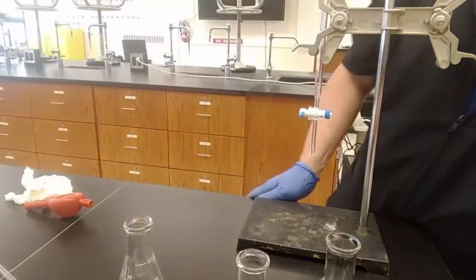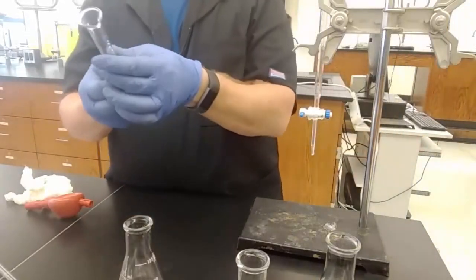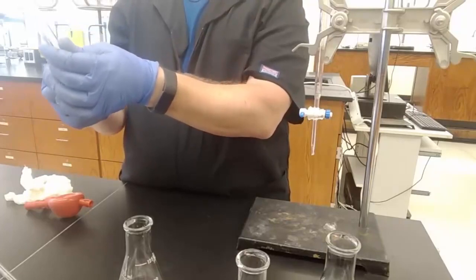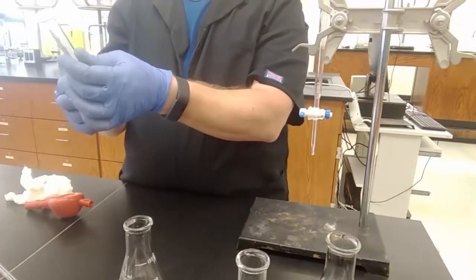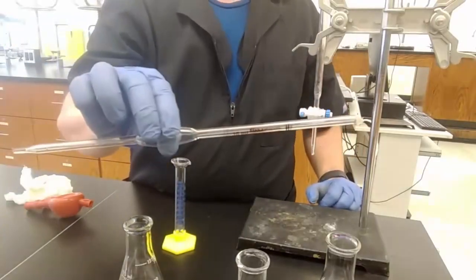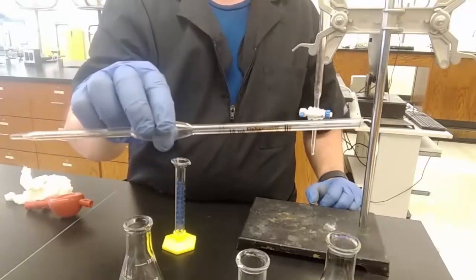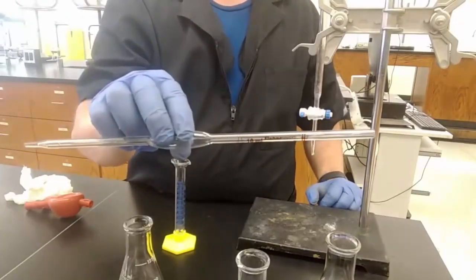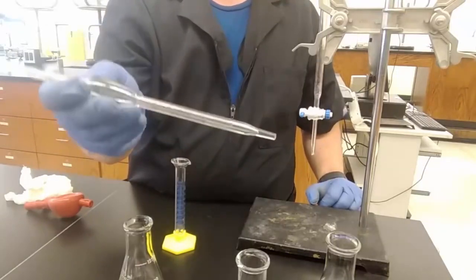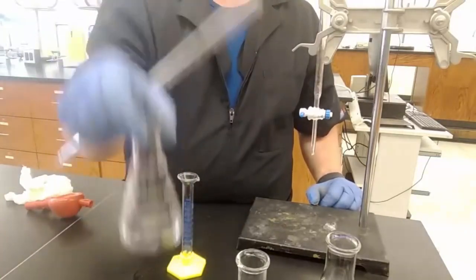Let's take the 10 milliliter graduated cylinder and remind ourselves what it says on it. Plus or minus, doesn't say. I'm pretty sure this is plus or minus 0.2 milliliters. Plus or minus 0.02 milliliters. An order of magnitude, one decimal place, more precise. Now, yeah, this one is old, and so it had droplets adhering to the inside, which is not good, but it's still more precise than this, which is infinitely more precise than this.